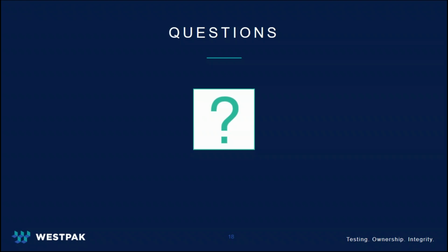Great, thanks, Nico. Next question, what is the difference between the dye for porous versus non-porous testing? So for non-porous testing, you'll need a little bit of a lower viscosity, which is basically more of the wetting agent, whereas the porous testing needs a higher viscosity, which is less of the wetting agent. And you can refer to the slides for the percentages of each.